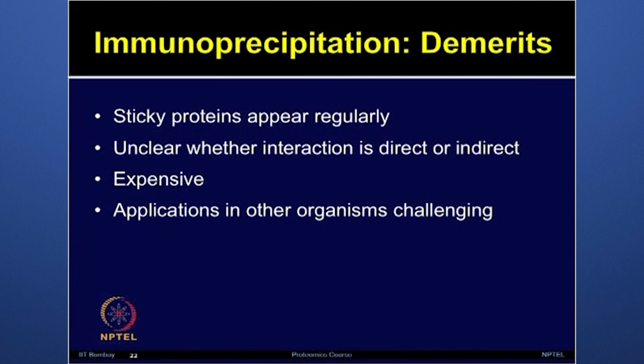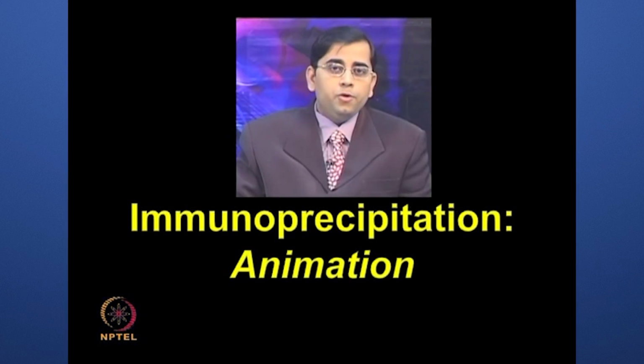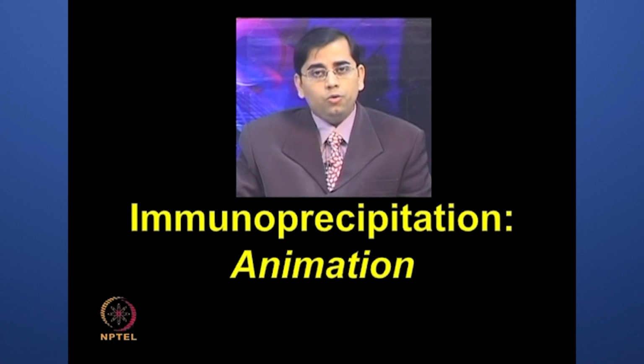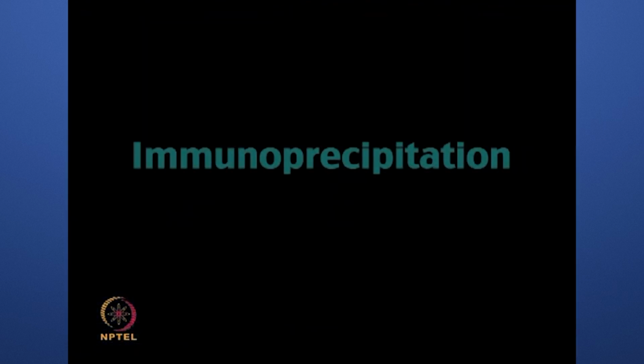Applications in organisms other than yeast have been challenging, but now people have applied this method to different types of organisms. So, let us describe the immunoprecipitation method, and how this mechanism occurs, in more detail by showing you this animation.